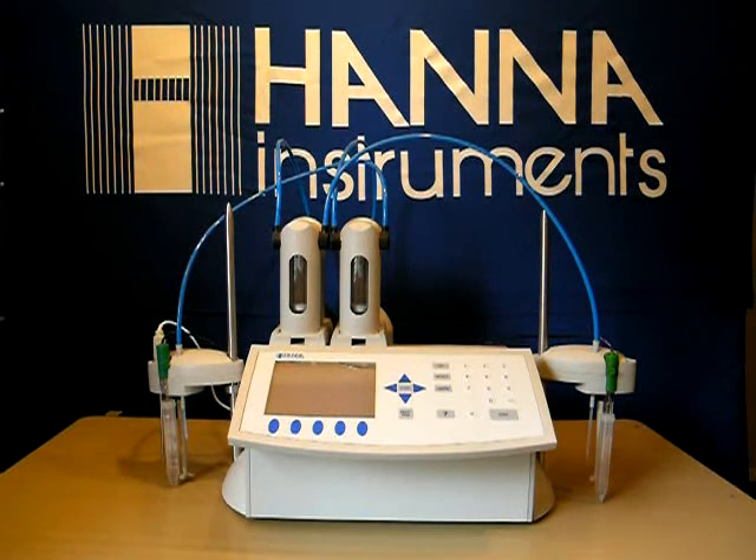Welcome back to Hanna Instruments. We are going to continue our training on the 902C auto titrator today. We're going to be doing free SO2 testing. We have our .02 iodine hooked up to our burette, our ORP probe in place, and we've selected the free SO2 method.